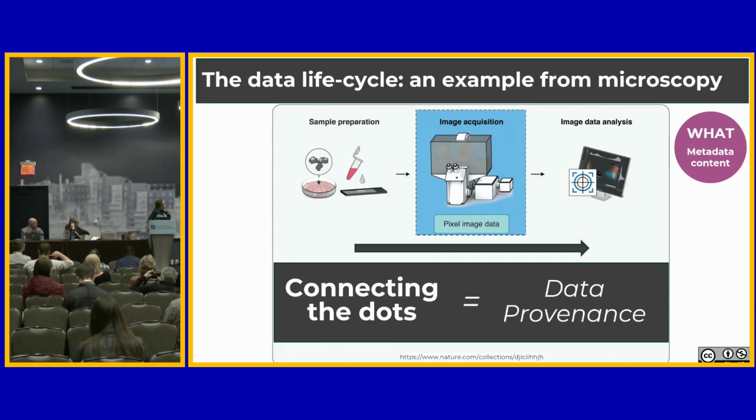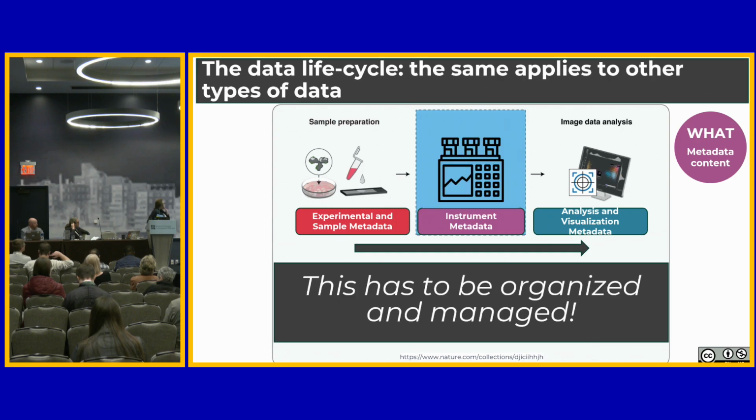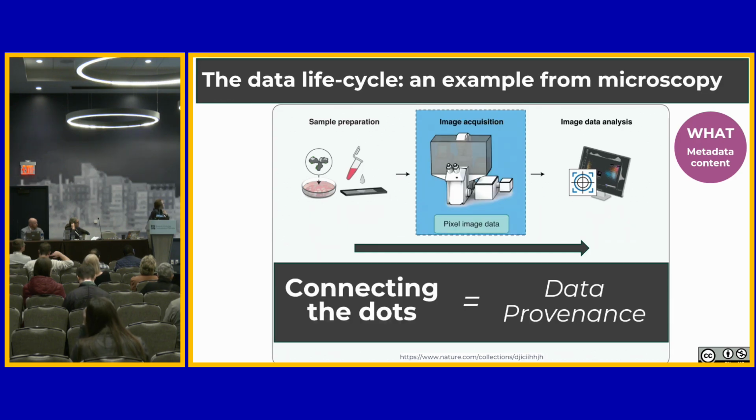Now I'm going to give you an example. The first thing is an example for microscopy. This is actually similar to the slide that our commercial partner was presenting. There is sample preparation, image acquisition, and image data analysis.